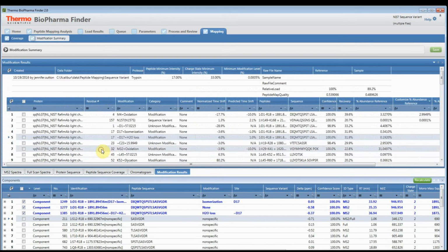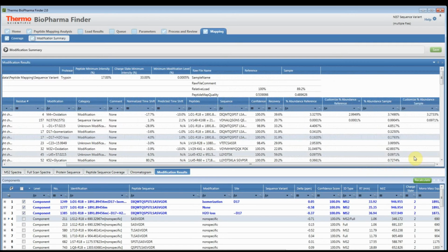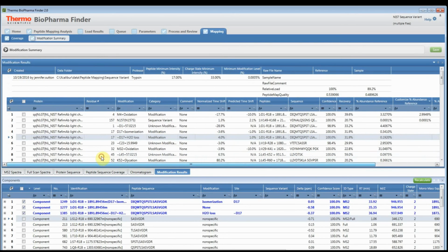But I think this is step one in giving you a little bit more control over how to control the quantitation and relative abundance of what's in here. What I hope happens is that you'll start to realize that the values that the software does by default are pretty similar to what you have been calculating by hand. I hope that's what actually comes out of this.